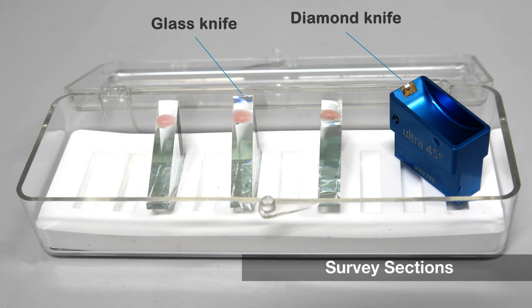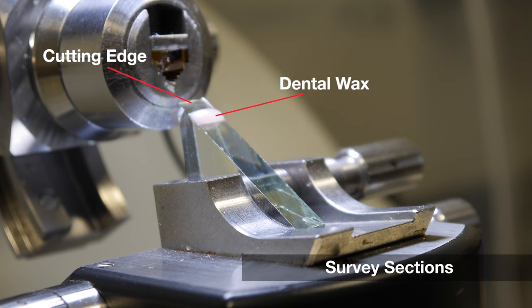First a square is cut, then scored and fractured diagonally into two triangular glass knives. A dab of dental wax is placed just below the knife edge, to hold a drop of water.